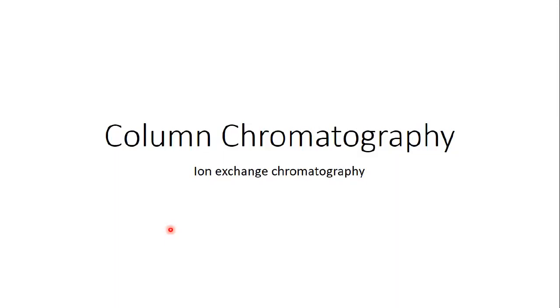Hello guys, in this video I'm going to continue speaking about column chromatography, and I will be mentioning especially ion exchange chromatography. I will be speaking about the principle of ion exchange chromatography, how to perform it, and everything in detail. So if you are interested to know more about ion exchange chromatography, watch till the end.